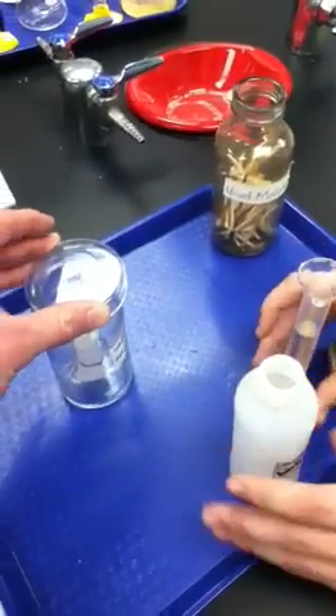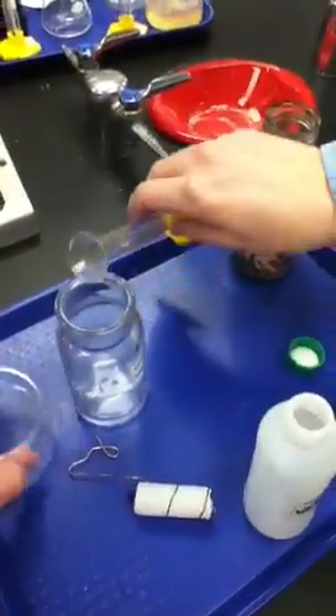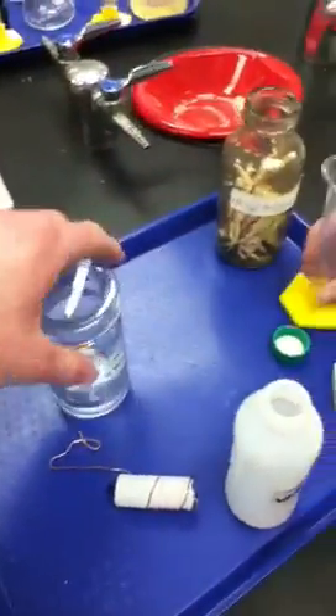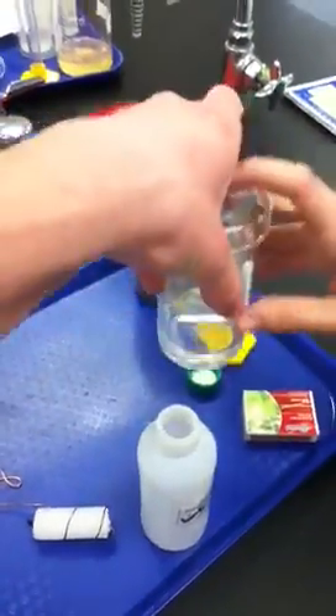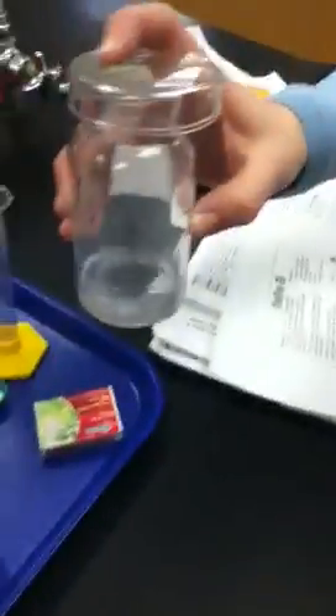Now we're going to remove the candle, put that in, tap it, and shake it. What should happen is a precipitate should be formed because the liquid is having a chemical reaction. And as you can tell, there's a fuzzy appearance turning into the water — it turns kind of foggy.